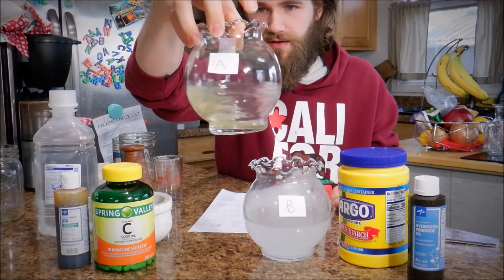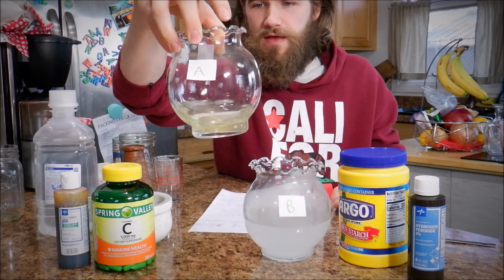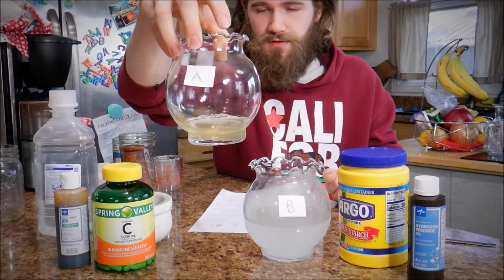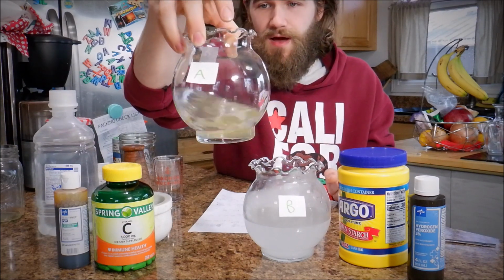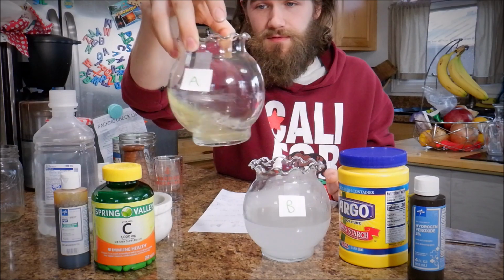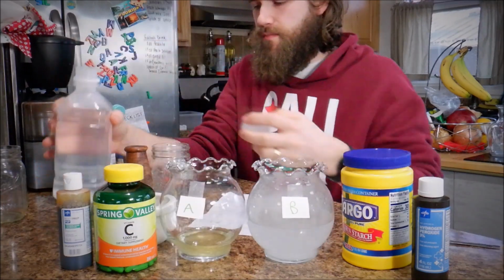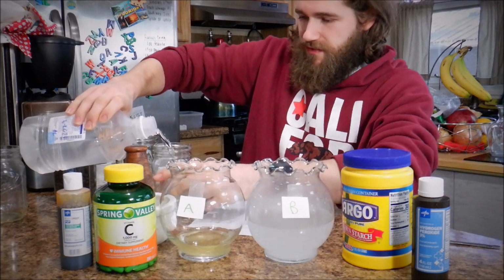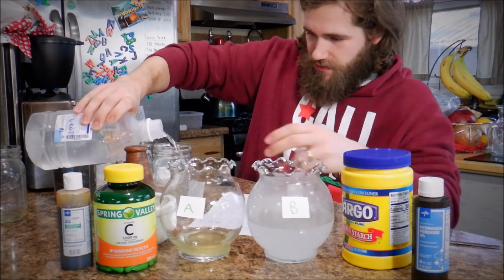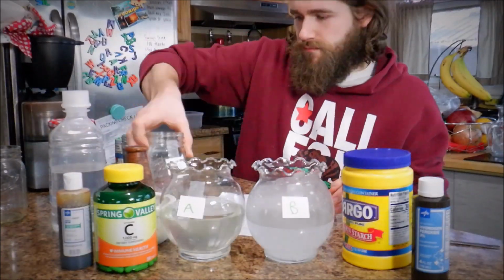What is happening is the iodine, which is colored I2, is reacting with the ascorbic acid and becoming iodide, which is I minus, and this solution is colorless. Alright, so now that we have that, we're going to top it off. So we have about 500 milliliters in solution A. This is just distilled water we're adding in.